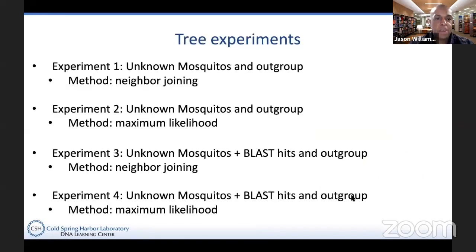So now, remember, when we did BLAST last week, one of the things I told you is that the BLAST result alone does not tell you whether you have identified a species or not. If we have BLAST evidence and also phylogenetic evidence of what species we're looking at, while I can't tell you that you've reached an infallible conclusion, we can at least come to a conclusion that we have a lot of evidence for a particular inference. These are types of experiments that we could do, and I'm going to explain what they mean in just a little bit.